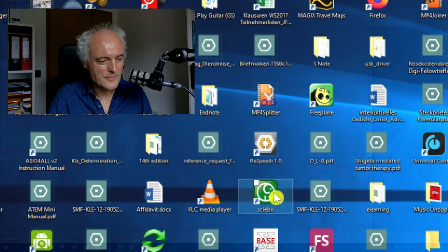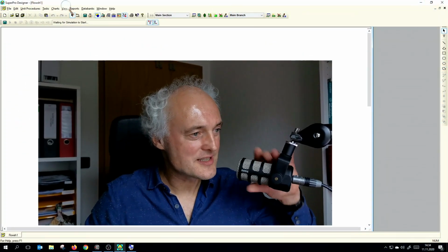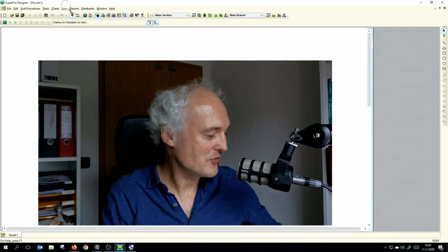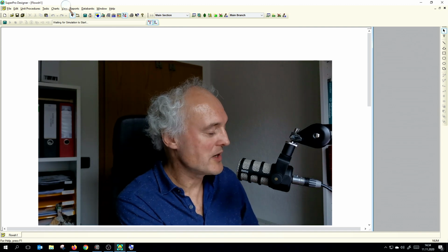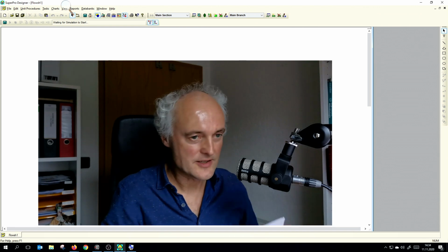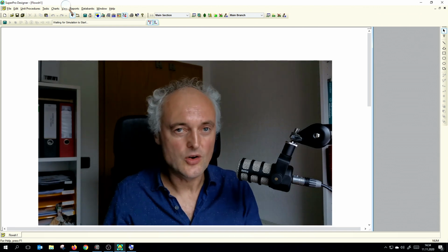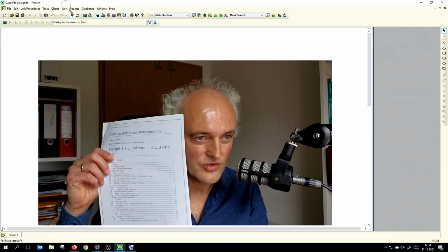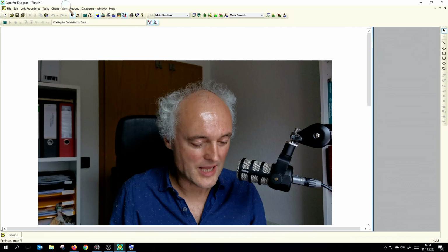Okay, here we go. So this is how it looks if we just open the software. What we're working on is the first example. So this is hopefully the document you also have next to you, and this is what we will have a look at.